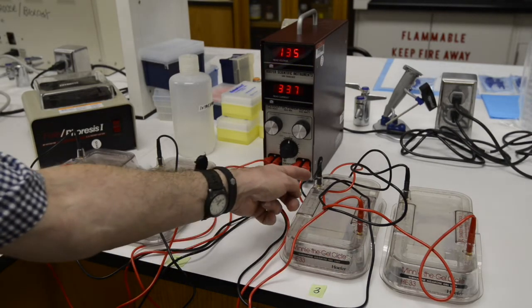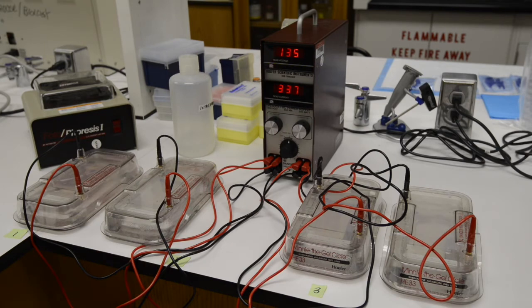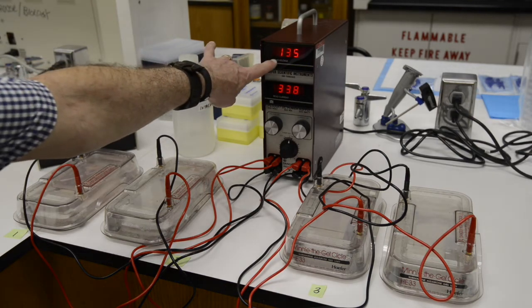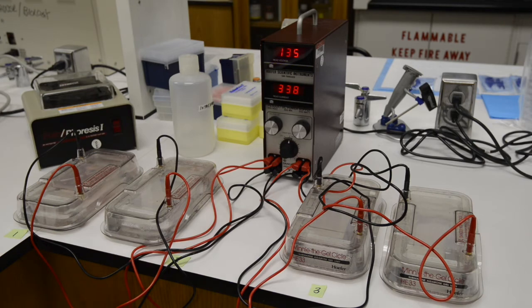Once the gel is loaded, then put the cap on the running tray. You can see the wells are farthest away from me here. That's where the negative terminal should be because DNA is going to move from the negative terminal toward the positive terminal.